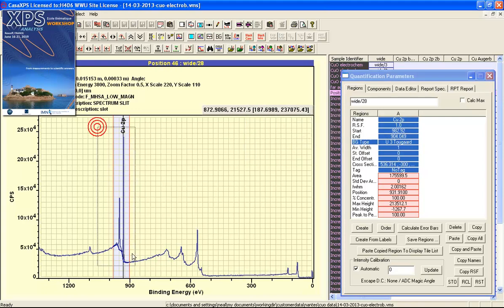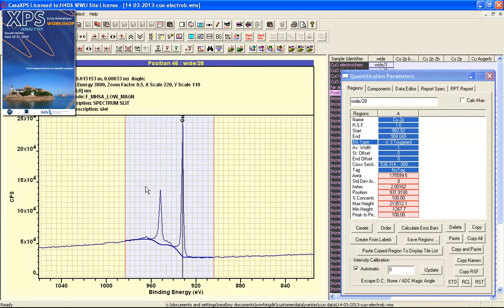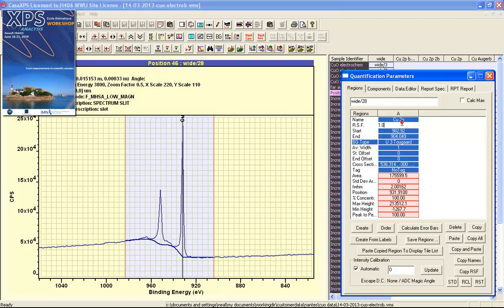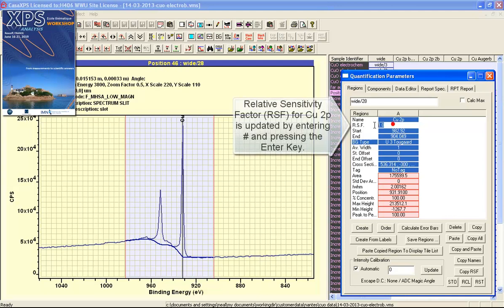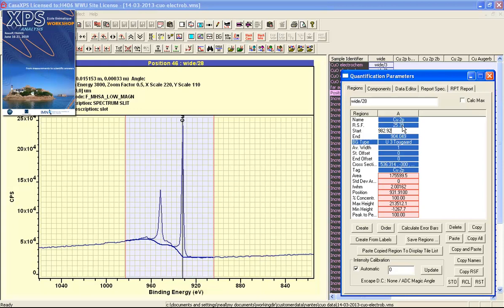I have now focused on the copper 2p using the region limits. To update this region with appropriate parameters for this interval, I need to press hash and then return. Because the name is copper 2p, the element library is searched and the relative sensitivity factor is updated.